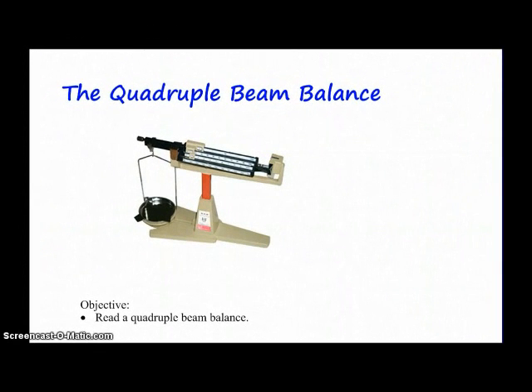This video is on the quadruple beam balance. Your objective to watching this video is to be able to read a quadruple beam balance.